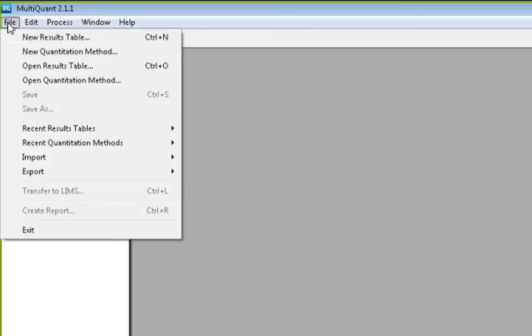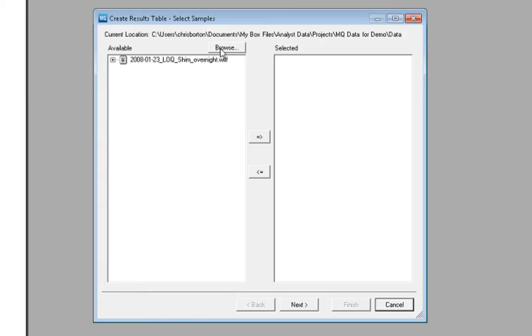To create a new results table from acquired data, you first select File, New Results Table. From here, you can browse your computer for a dataset.